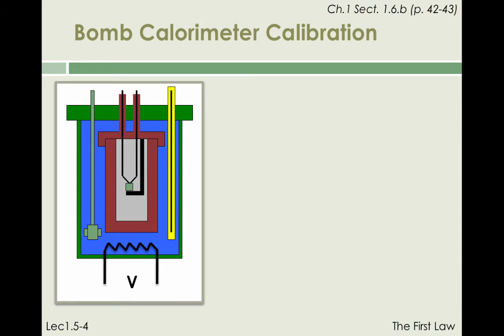Two methods are routinely used to calibrate a calorimeter. The first method consists in running a combustion reaction in the calorimeter for which we know the heat of reaction. Measurement of the temperature rise delta T as a result of the exothermic reaction will allow us to determine Ccal. The second method, to be described next, consists in using a resistive heater to transfer heat into the calorimeter.